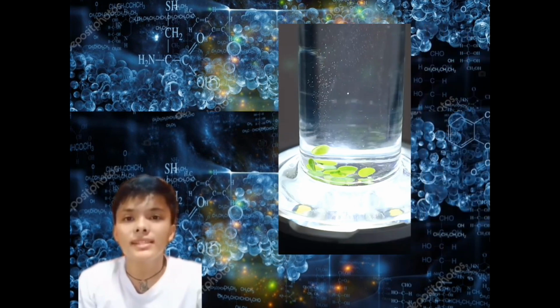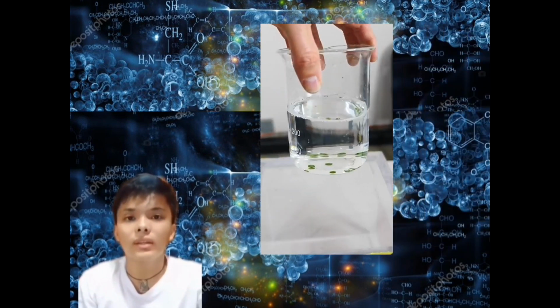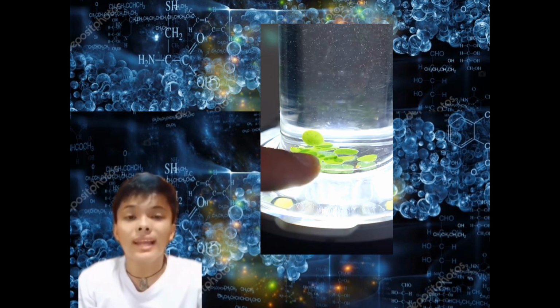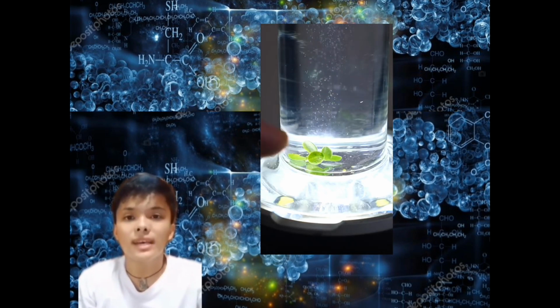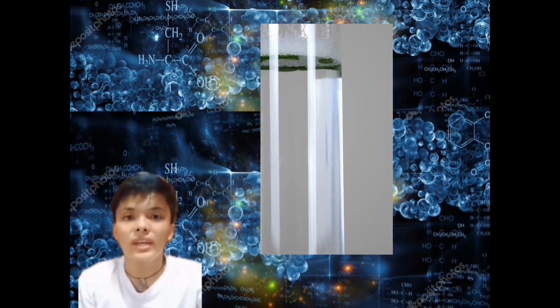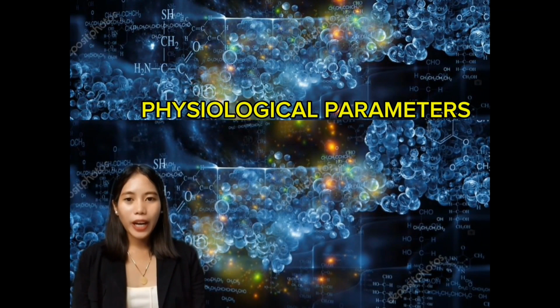Photosynthetic pigments. The study measured chlorophyll content of L. sativa leaf samples, analyzing their absorbance at different wavelengths using a Genesys 2 UV-VIS spectrophotometer. Physiological parameters.